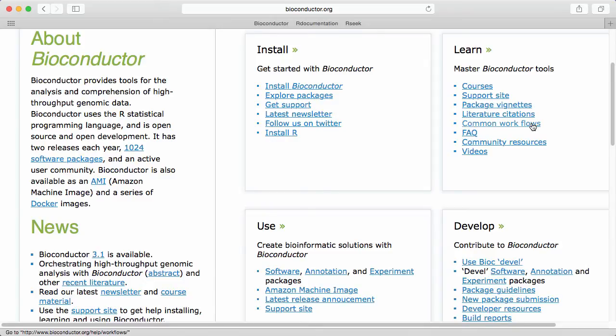Workflows is a new thing in Bioconductor. The idea is that they detail even bigger pieces of information than a package vignette. Workflows show how to use multiple packages together to achieve something. Workflows is a new addition to Bioconductor so we don't have hundreds of workflows at the moment. But the ones we have are quite good I think and we are actually working on adding new workflows.